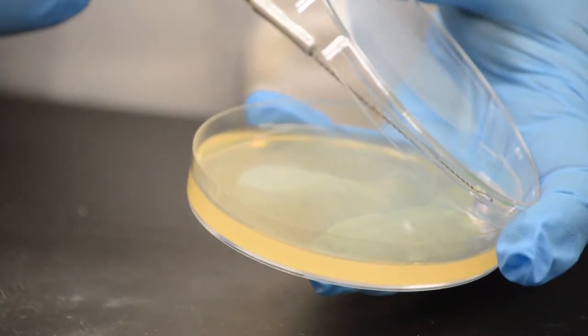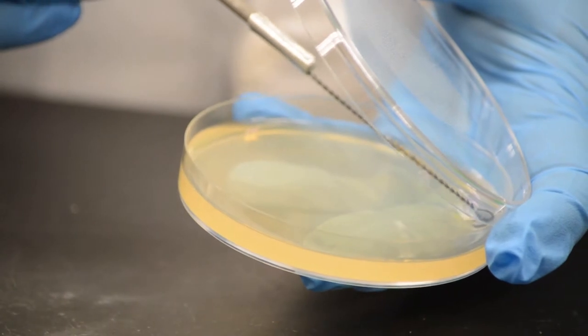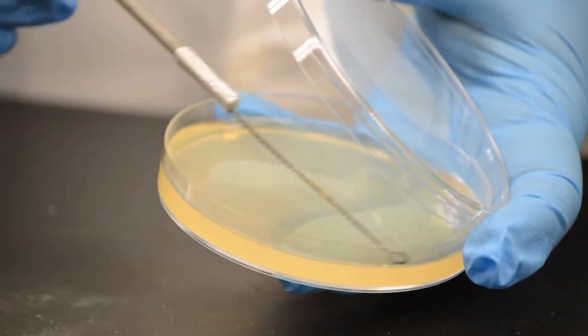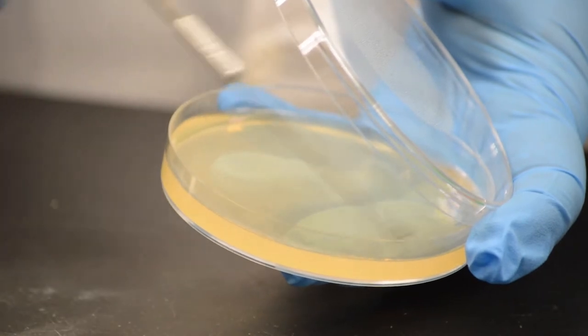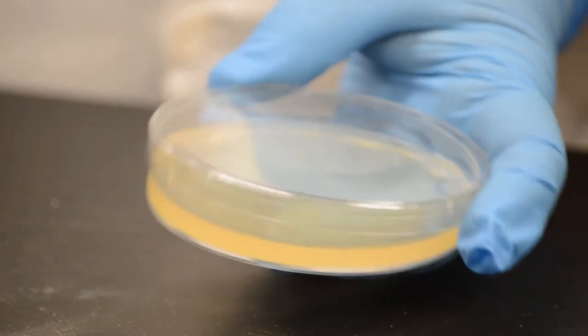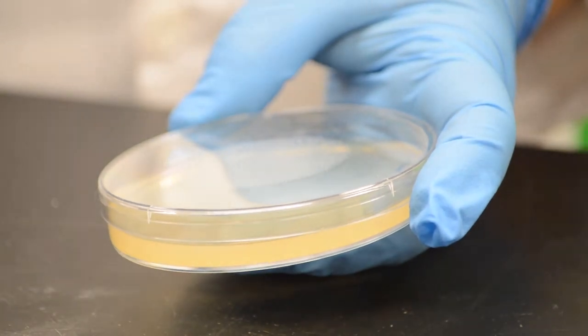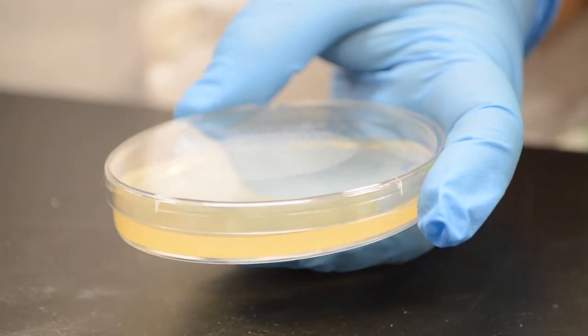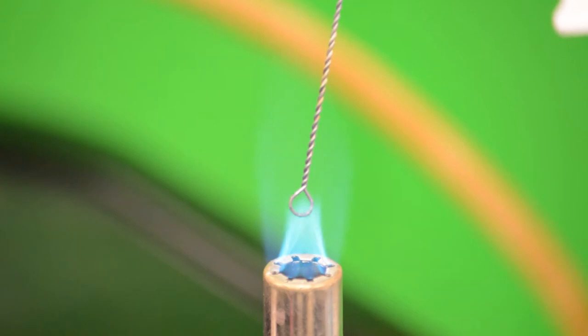Raise the lid just enough to put the inoculating loop inside. Holding the loop like a pencil, carefully smear the suspension in a thick streak on one section of the dish as indicated. Close the lid of the petri plate.